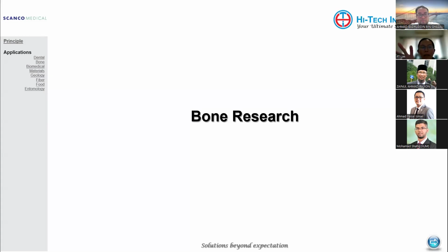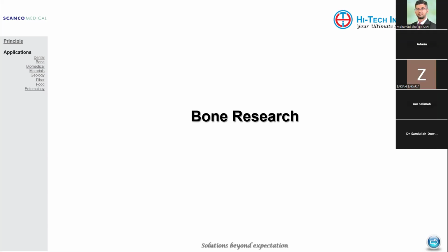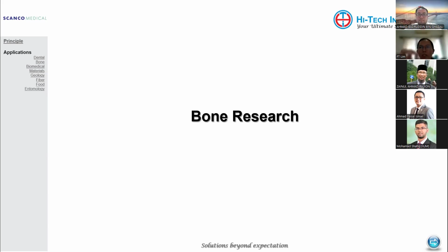the clinical one is something like the hospital types of CT scan. So there will be a certain amount of exposure. But of course, when we design the whole system, we ensure that the exposure in 1 minute is calculated as 550 micro sievert. So from what I experience, if the installation is in clinics like a radiology department or in a hospital, they will still require shielding.